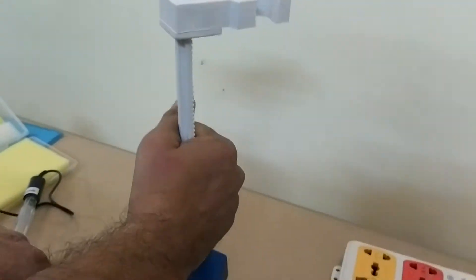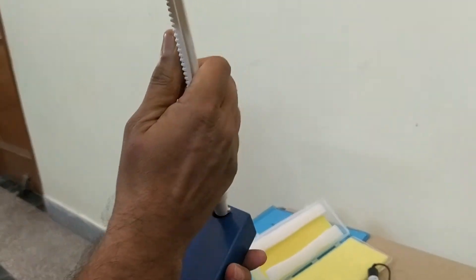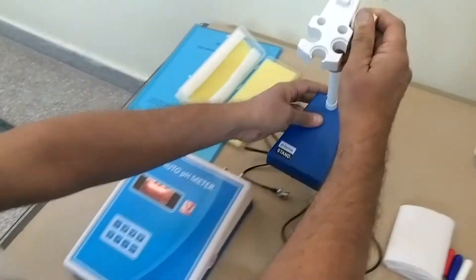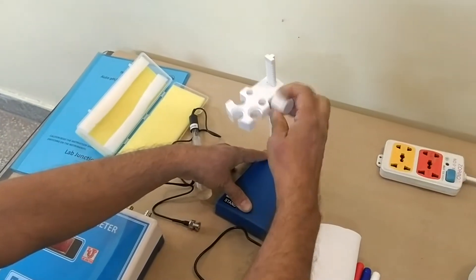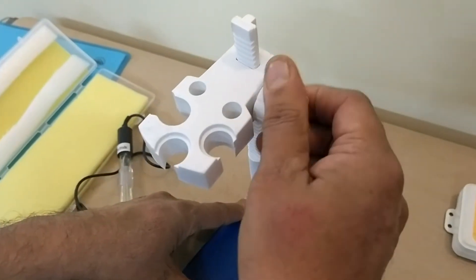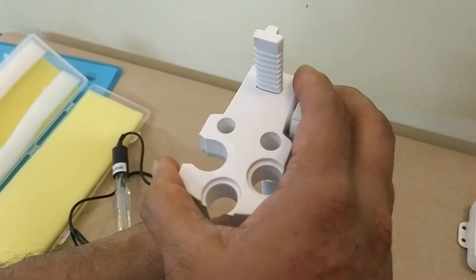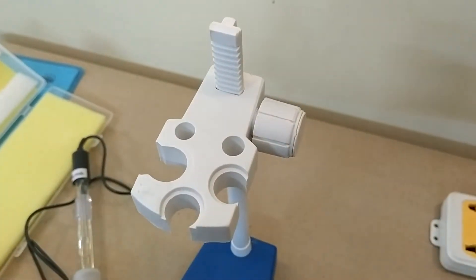How to mount this: you can mount this like this, in front. You can also adjust it up and down to whichever level you desire, to attain the level of the pH combination electrode.